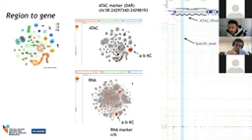So what does it all mean now? I'm going to go through a couple of examples to illustrate the data. So here's a gene called Crumbs. It's expressed specifically, or relatively specifically, in the alpha beta Kenyon cells. This is clustered in the RNA. And that particular region here, you can see the small yellow peak, I hope, is only accessible here. There's some noise here in the photoreceptors, but in the brain, it's only accessible in the alpha beta Kenyon cells.